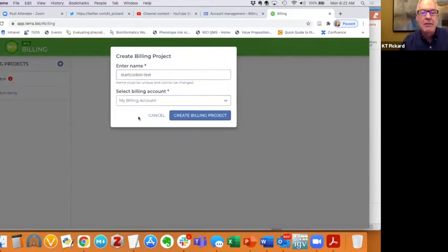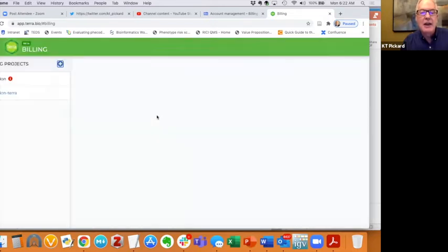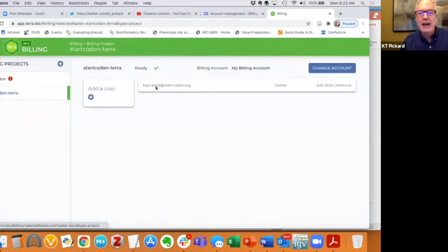This is my billing account, the one that's coming from Google Cloud Platform. I click on create billing project, and that would create a new billing project. Again, the one that I just created before was Start Codon-Terra. And then you can add users to this if you want to add other people that could use that Terra account. This is the place where you do it.